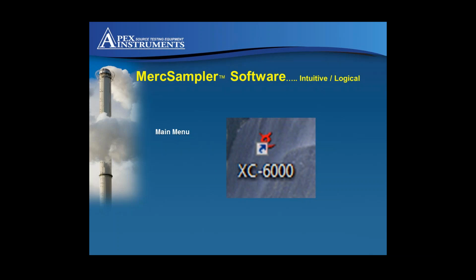Does Apex have any specific media converter? I know a lot of other SEMS type folks recommend their proprietary media converter. Generally, no. That's your choice really, because you've probably got several. What you see commonly is the Black Box version as the media converter. That's the most typical one. We don't have any issues with that one. It seems to work fine. It's pretty straightforward.